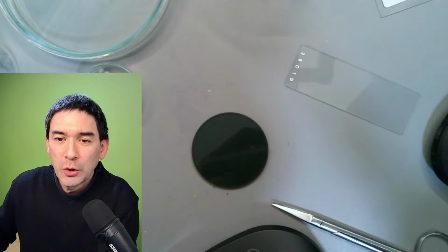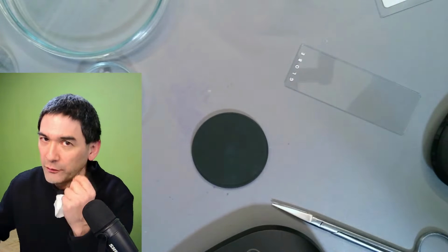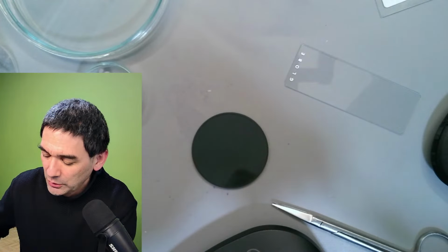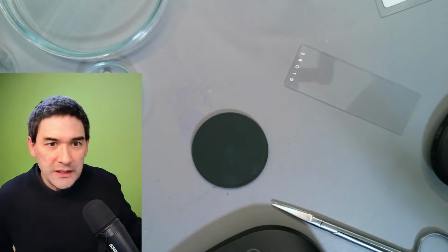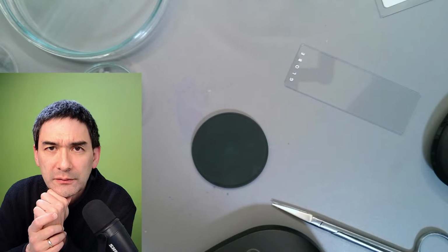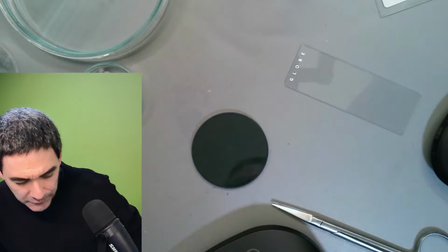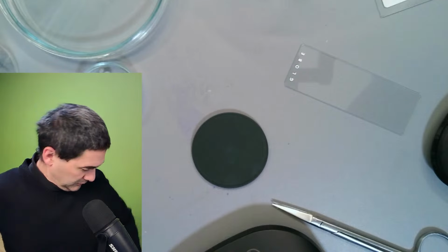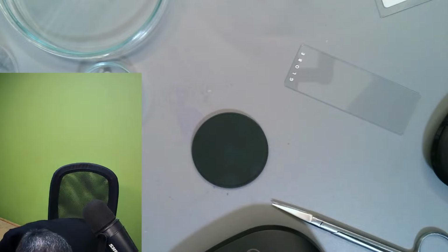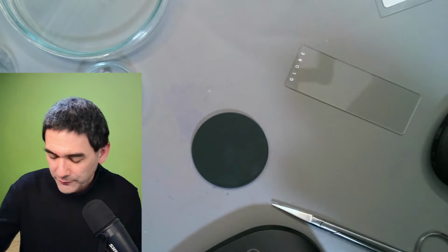Between artificial cotton and cotton. I only have the cotton that you use for cleaning your face right now. But when you look at plant cotton, that would actually be an interesting one. Maybe we're able to get some from a cotton plant. That would be interesting to see the differences. So I need the string again. Now the same thing happened with the string. It's on the floor. Okay, let's give it another try, just for the fun.